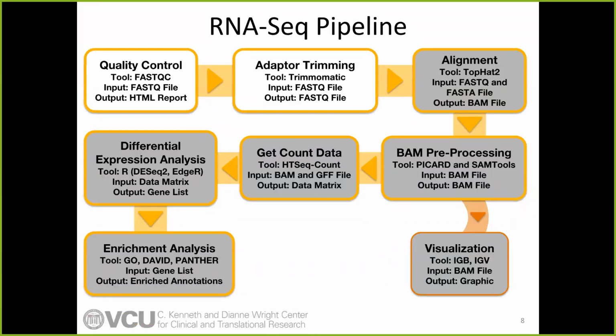Okay, so this is the basic generic pipeline that I present. We're going to go through the first 5 steps, and then we'll get to the use cases that you guys have picked.